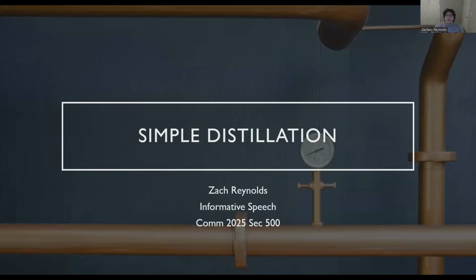For about the last 7 years, I've been enthralled with chemistry and its many applications. So in this video, I'm going to try and introduce one of the most basic yet necessary and consistently relied upon separation techniques. Simple distillation is a technique that utilizes the difference in boiling points for two or more compounds in a mixture. This idea is used in everyday life, from separating salt and water to distilling liquor.